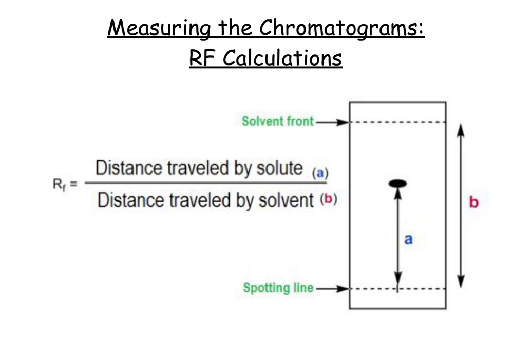So how do I actually measure something based on this? So let's say, if we're looking at that like this, the solvent or the water has traveled this distance from bottom to the top, okay? So this distance right here. My ink that I originally started with, so imagine this ink started as a little black dot right here, okay?